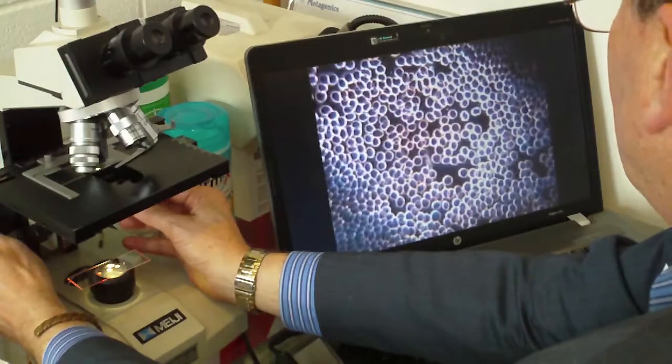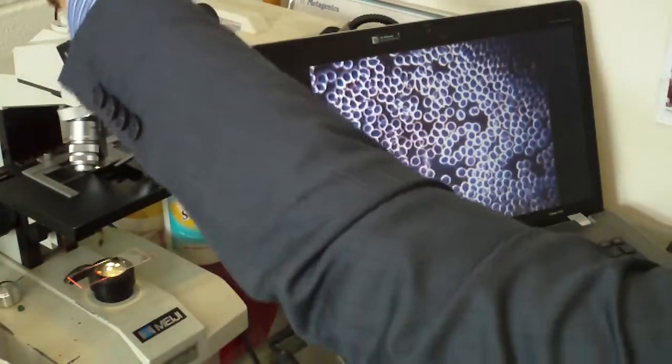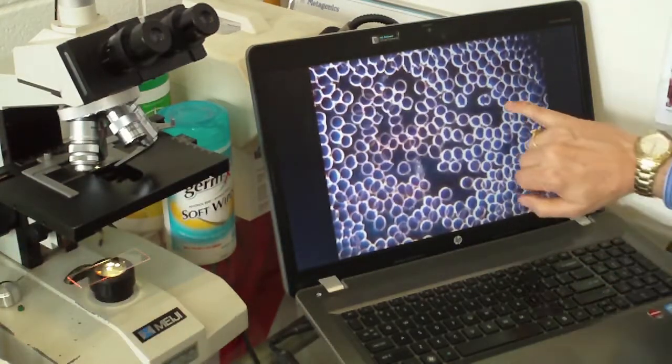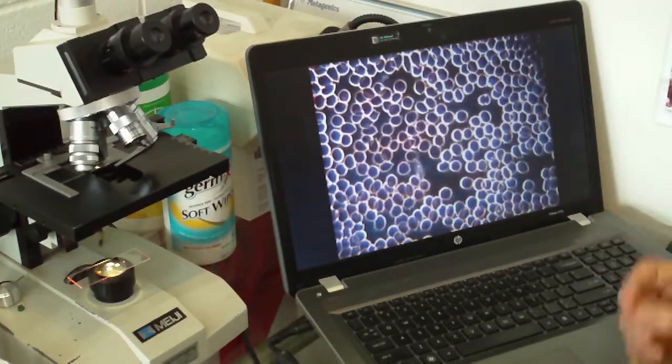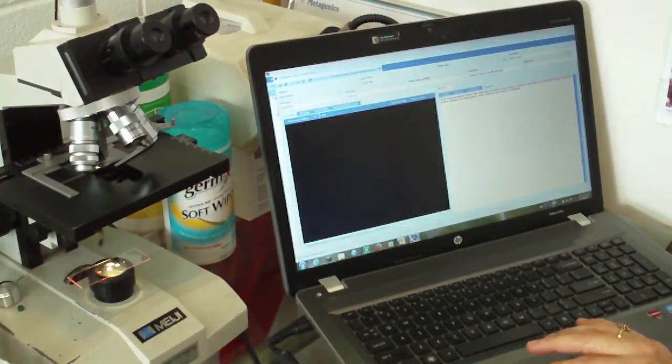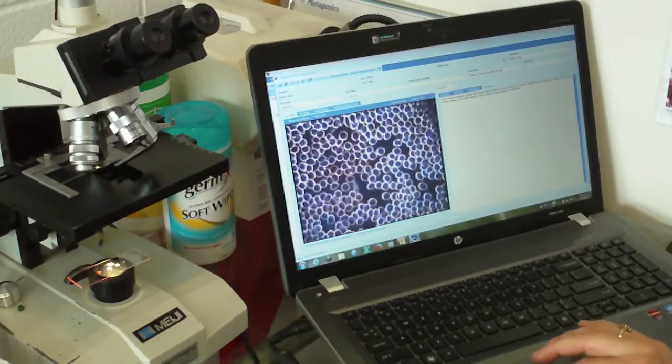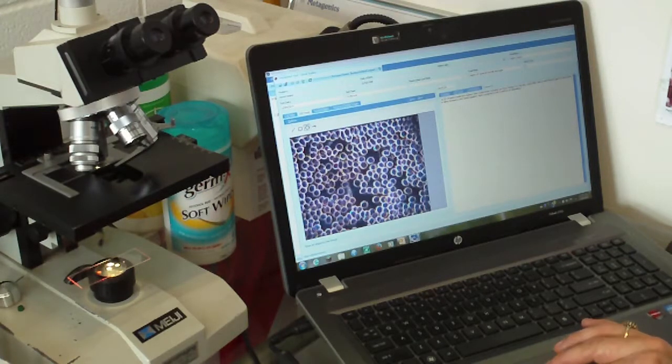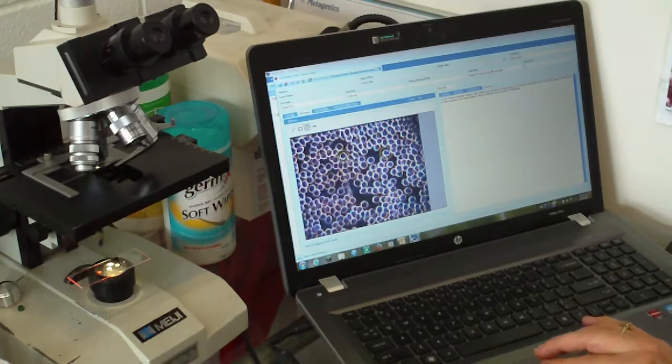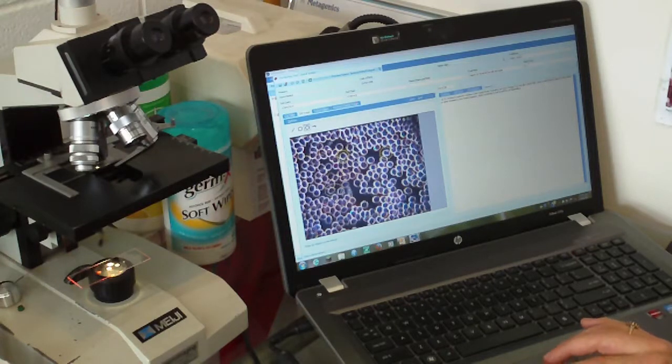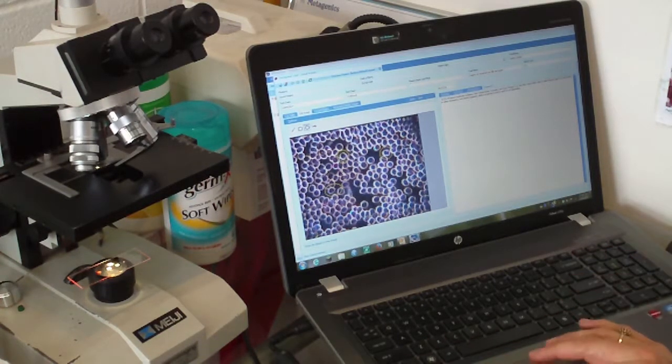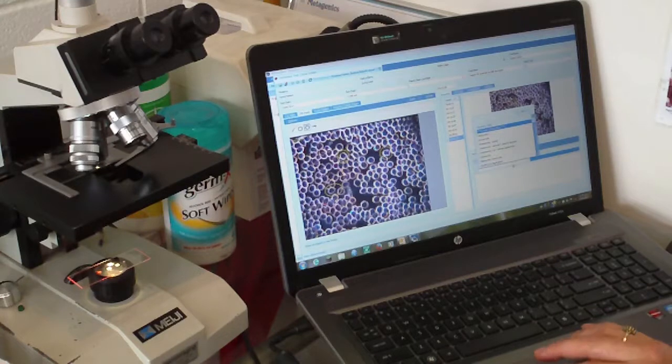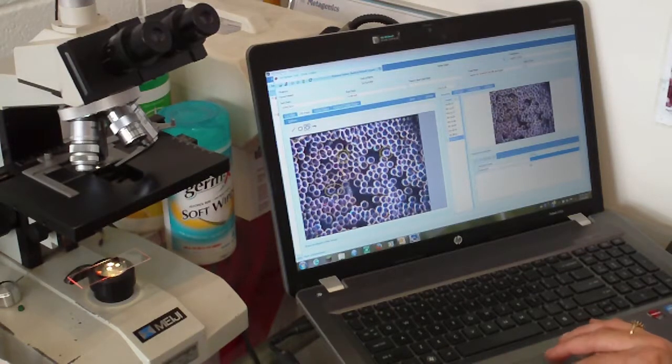Ah, now here's another area. Now, this is technically not in the readable zone, but I'll show you what these look like because they're a common feature. If you can see these distorted cell shapes. Now, because this isn't in the readable zone, I'm not going to be too concerned about them. However, I'm going to point them out for the purposes of the video. So if we found these cells in an area of normal blood, then this would tell me the patient is a bit of antioxidant and vitamin C depleted. Okay. I happen to know this patient took vitamin C this morning, and this isn't in the readable zone, but if it was, then we'll mark this. It's a little bit of mild echinocytosis.